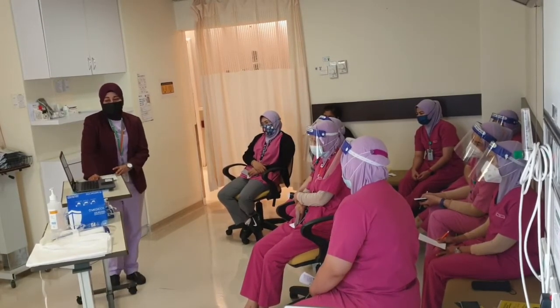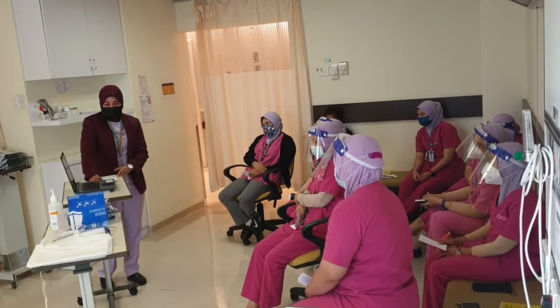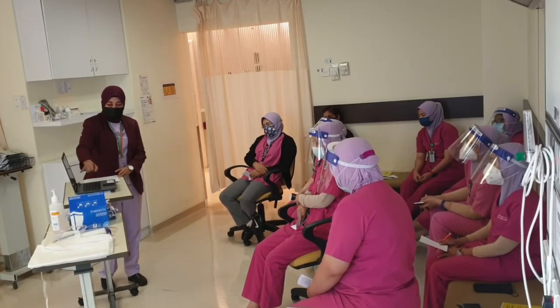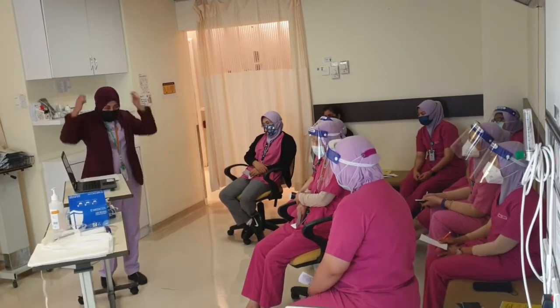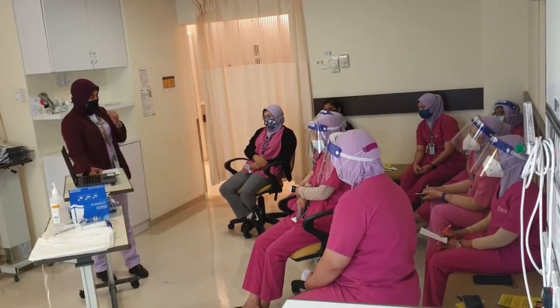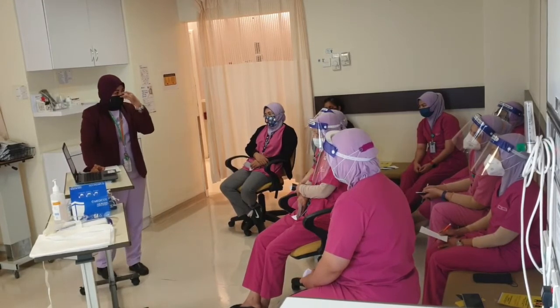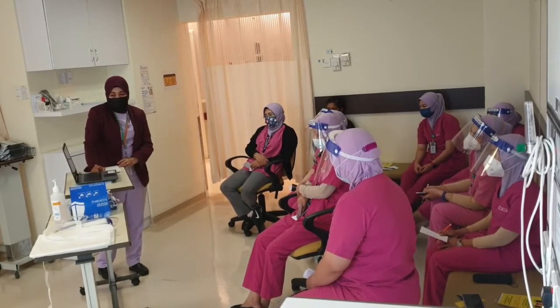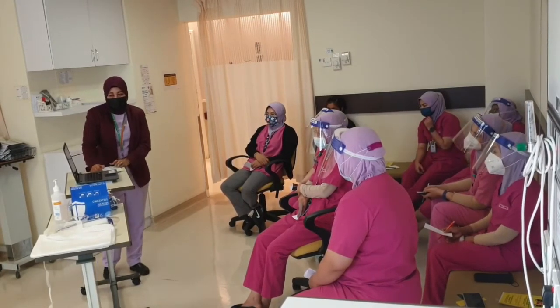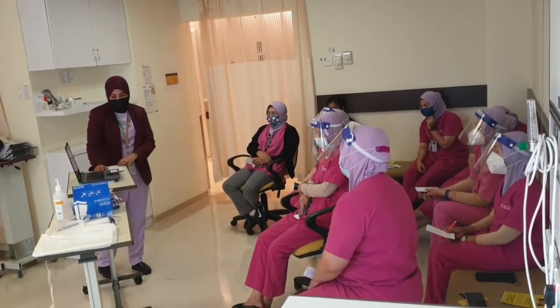Number 3, mask or respirator. Secure ties or elastic band at the middle of the head and the neck. See the picture, the steps. Either you use the elastic or tie behind. Fit flexible band to nose bridge. The one that I show you has a bridge here, so you need to fit it. Fit snug to face and below chin. That means from the nose to below the chin. And also you need to check the fit of your respirator.